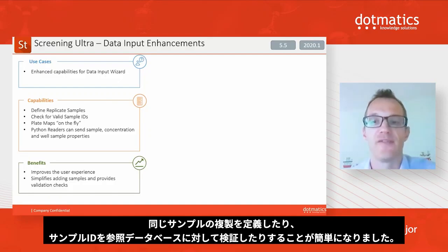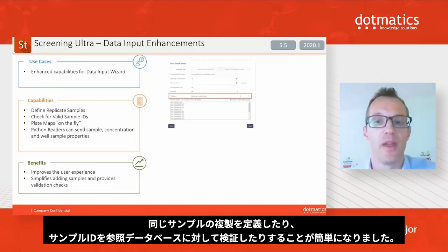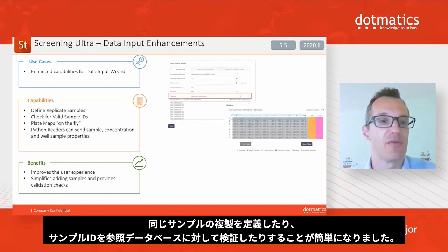Several improvements have been made to enhance the data entry experience in the upcoming release of Screening Ultra. It is now much easier to define replicates of the same sample and to validate the sample IDs against a reference database.